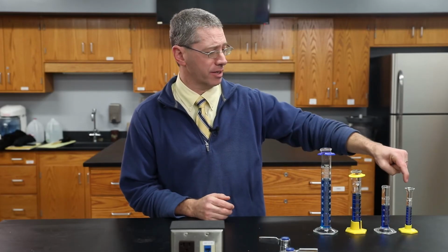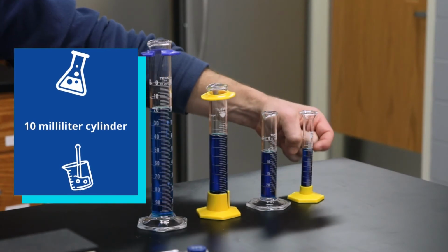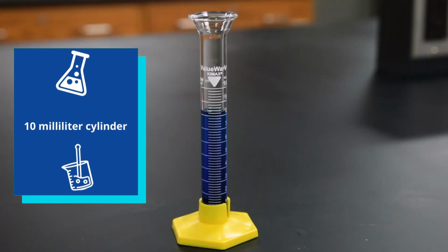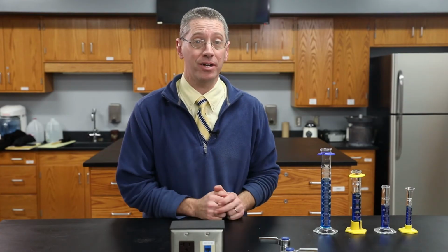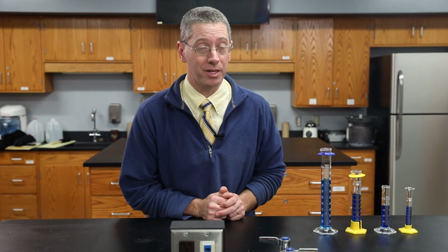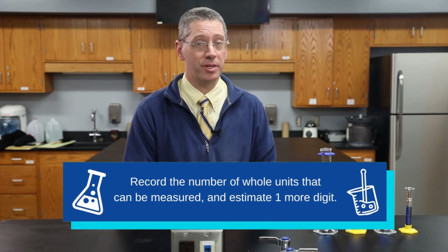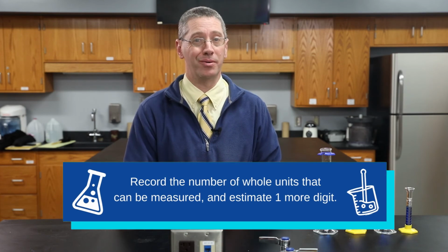And in the 10 milliliter cylinder that you see, all the little lines there are tenths of a milliliter, which means we can accurately record to the milliliters and tenths of a milliliter, so that estimated final digit would be hundredths of a milliliter. It's important to record the number of whole units that you can measure and then estimate one more digit.